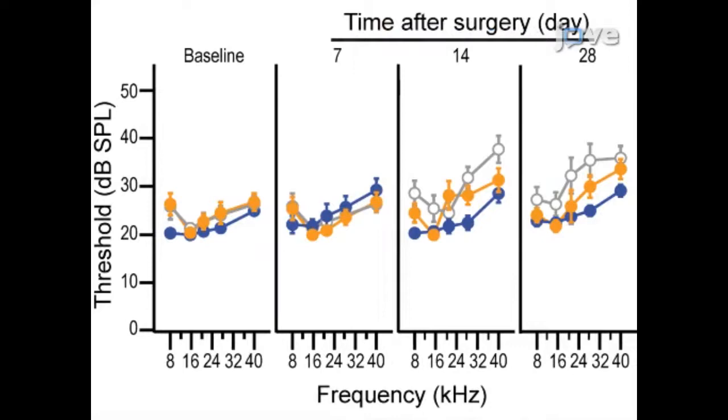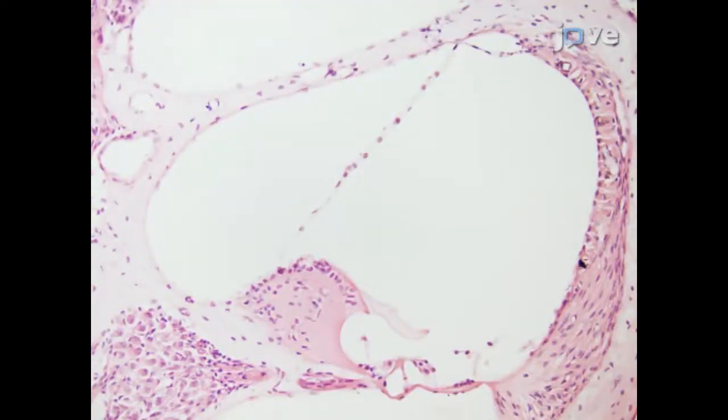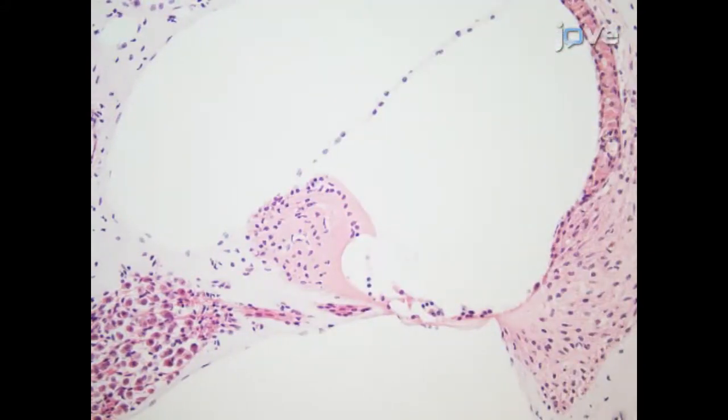This graph shows the ABR thresholds in response to tone burst stimuli in the range of 8 to 40 kHz over the same time period following microsurgery. Again, no significant differences were observed between bulostomy and transtympanic approaches. Morphological studies demonstrate that the scala media does not show alterations following vehicle delivery by bulostomy or transtympanic injection, indicating that either procedure alone does not result in damage.